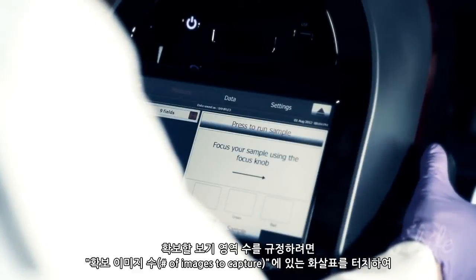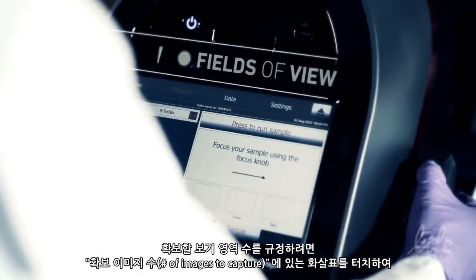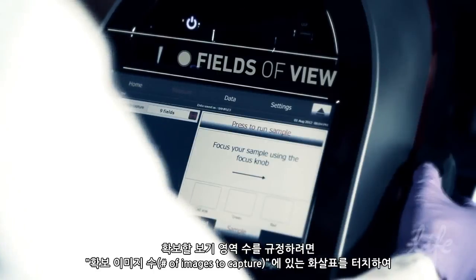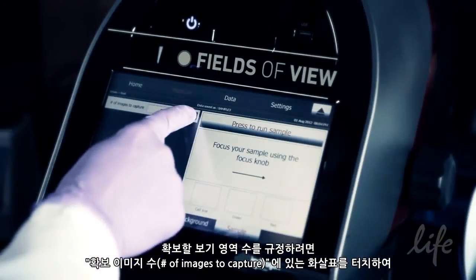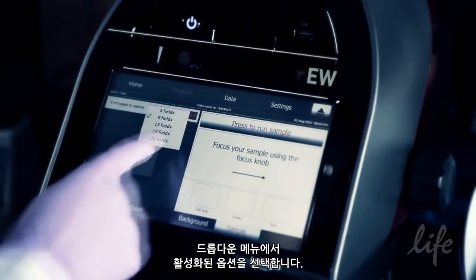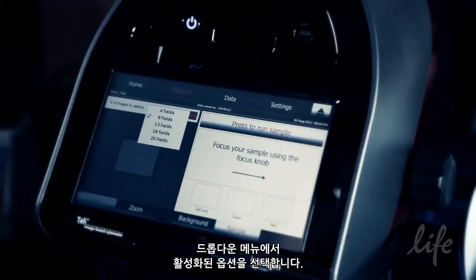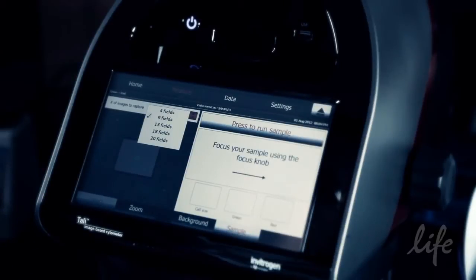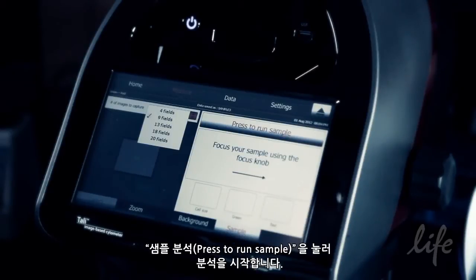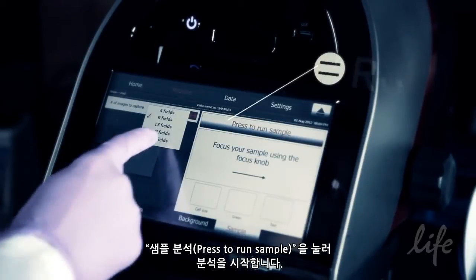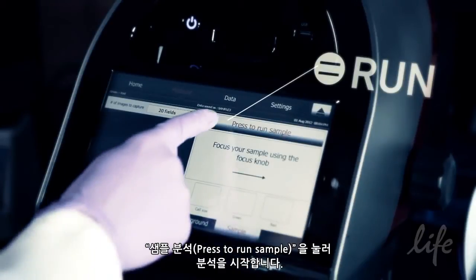To specify the number of fields of view to capture, touch the arrow button on the number of images to capture drop-down menu and select from the available options. The more fields of view analyzed, the more powerful the statistical analysis. Touch 'Press to Run Sample' to start the analysis.